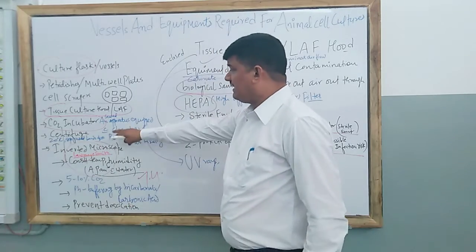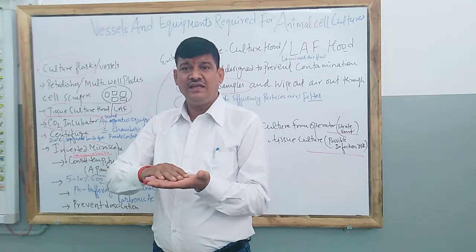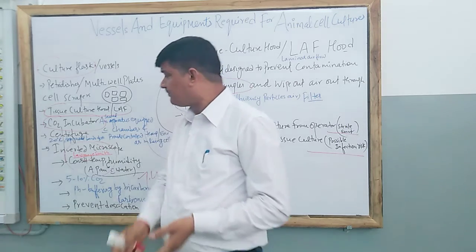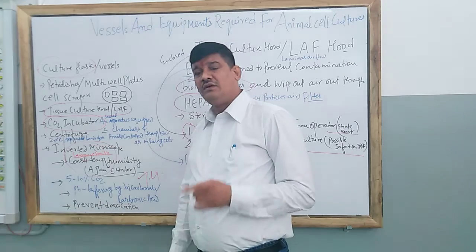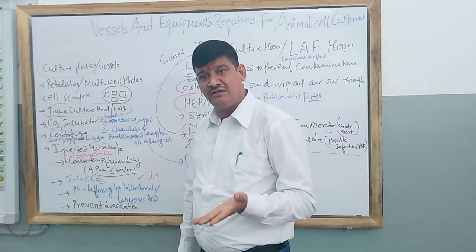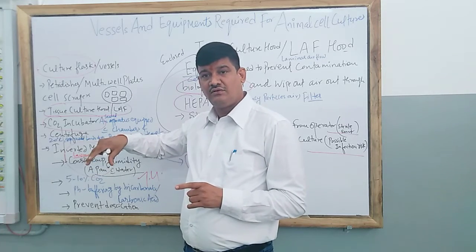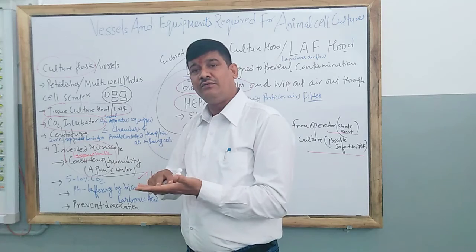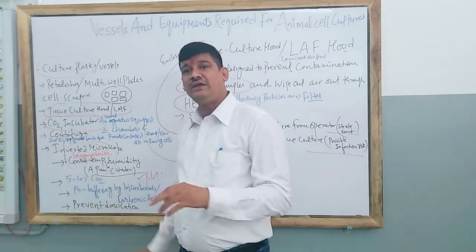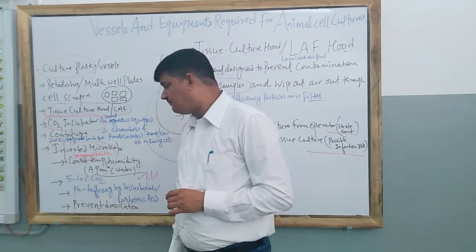What happens here? Actually, the cultured cells which we are taking on the petri dishes settle at the downside and the nutrient medium is upside. Therefore, in that inverted microscope, the source of light and the condenser are above. That is opposite from the classical microscope. This is because the cells sink down, that is, cells are present at the bottom. Therefore, the source of light is inverted so that we can visualize the picture well. So this is the inverted microscope.